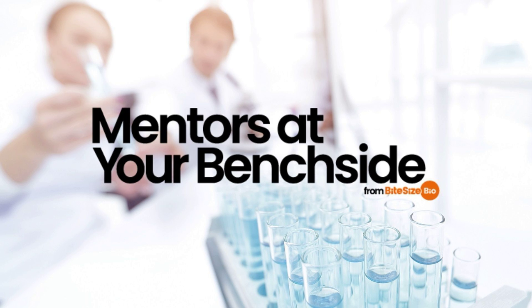The problem is that we rely on resolution too much as the ultimate metric to judge structure quality, and I've been adding to the problem. Throughout this introduction, I've highlighted resolution several times when comparing Cryo-EM to its counterparts. I haven't spoken about any other metric. Just to be clear, over-reliance on the purported resolution isn't a problem caused by the emergence of Cryo-EM. It goes deeper than that.